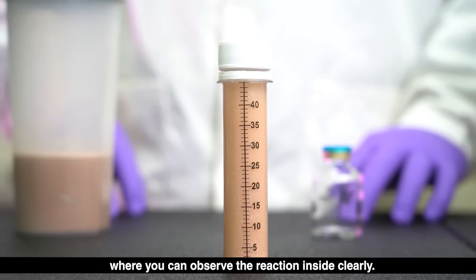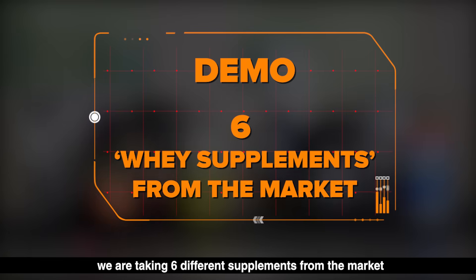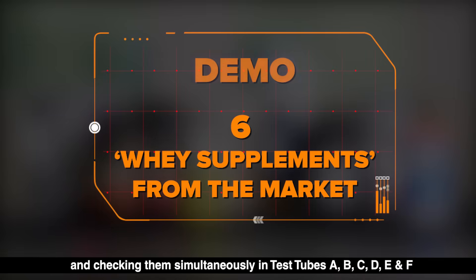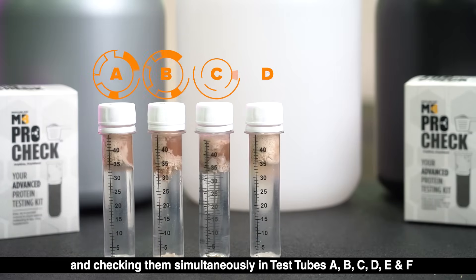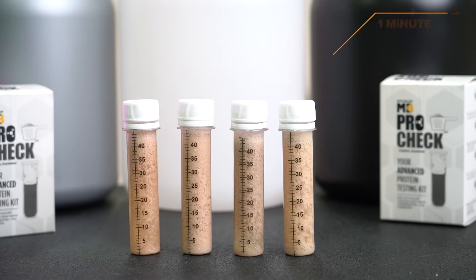In this demo, for your complete understanding, we are taking six different supplements from the market, all of which claim to be whey proteins, and checking them simultaneously in test tubes A, B, C, D, E, and F.